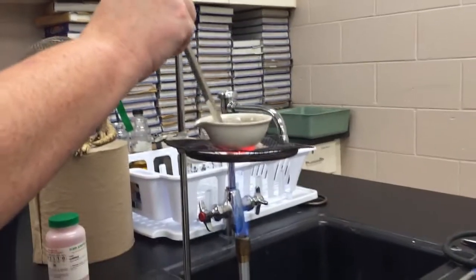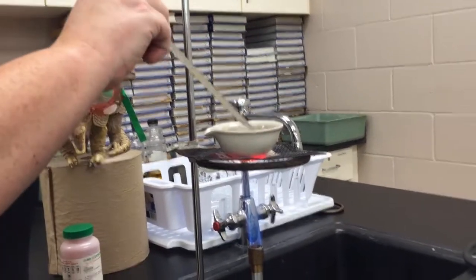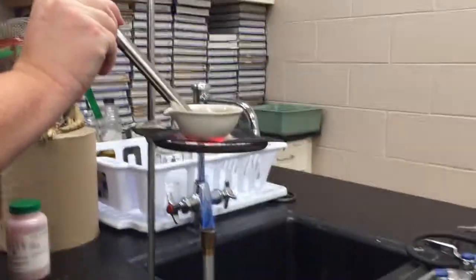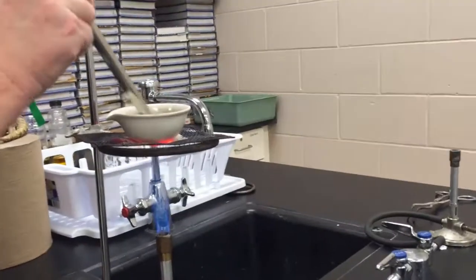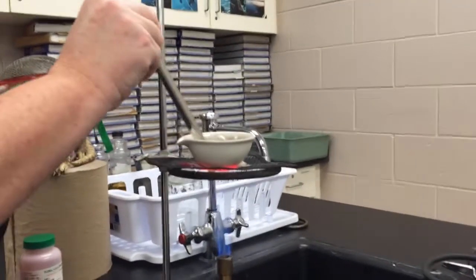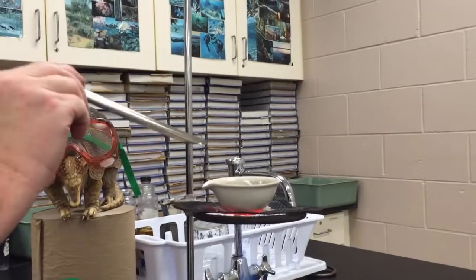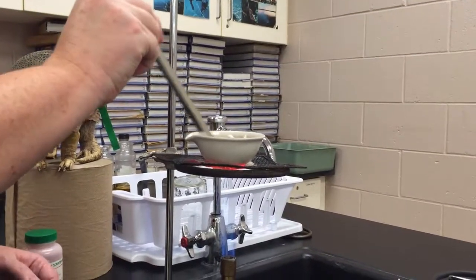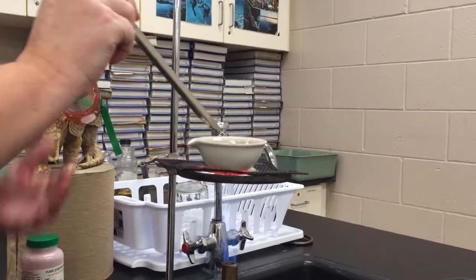If there was a chemical reaction, you have to think about what sort of reaction could possibly be taking place. I put pure copper atoms in there. But you have to remember that there's matter all around it. So it is surrounded by the air, which has 78 to 80% nitrogen in it.